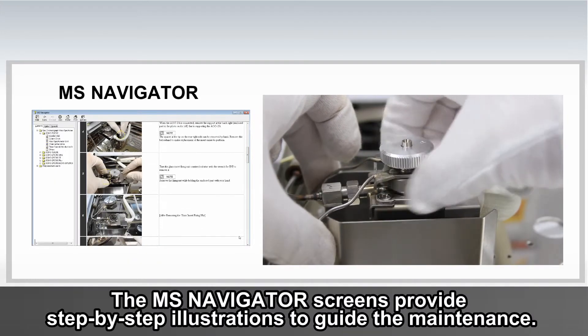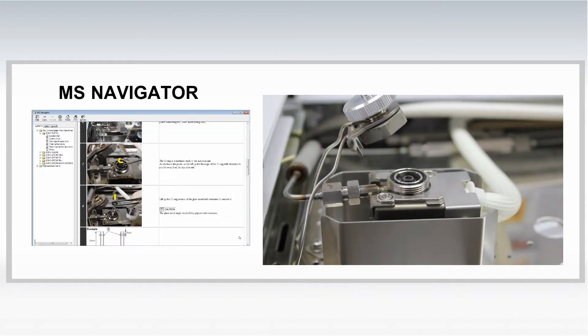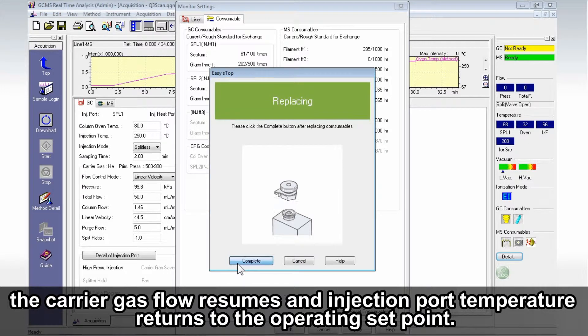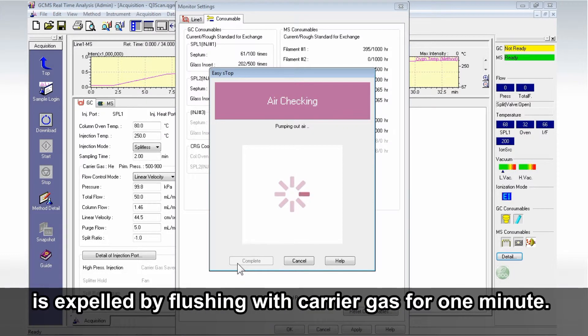The MS Navigator screens provide step-by-step illustrations to guide the maintenance. When the maintenance is complete, click Complete. The carrier gas flow resumes and injection port temperature returns to the operating setpoint. Any air which may have inadvertently been trapped in the injection port during maintenance is expelled by flushing with carrier gas for one minute.